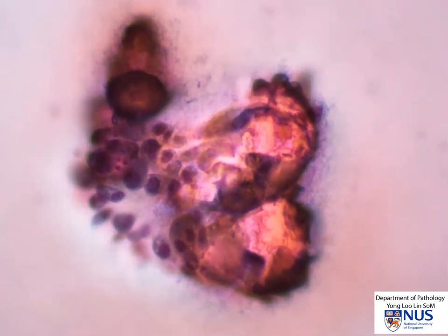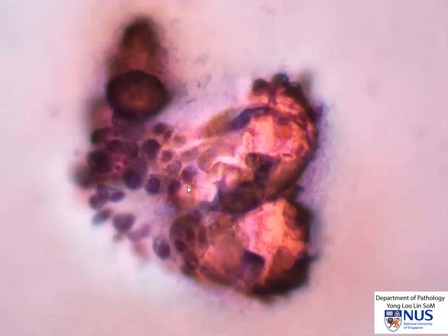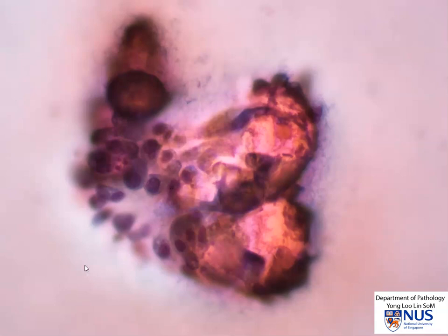What I'm showing here is a classical appearance of papillary thyroid carcinoma with cystic change. This can occur as a primary in the thyroid or as a cystic metastasis in a lymph node. So in a head and neck enlarged lymph node, such as a cervical lymph node, where we can see cell clusters with bubbly cytoplasm and some calcifications, metastatic PTC is very high up on the list. We may not actually see all the nuclear features of PTC, but the other features are quite classical.